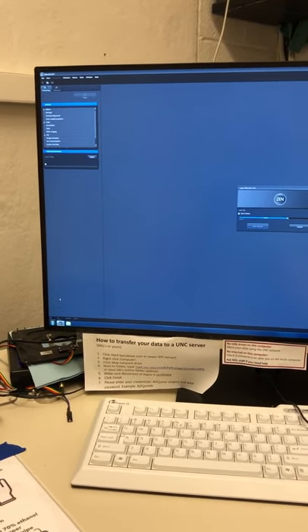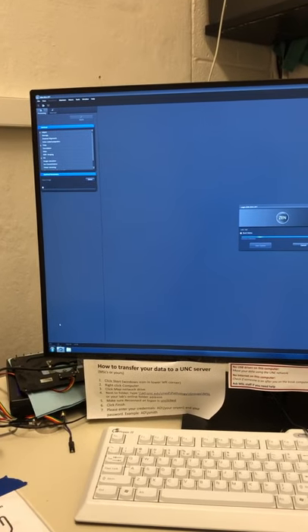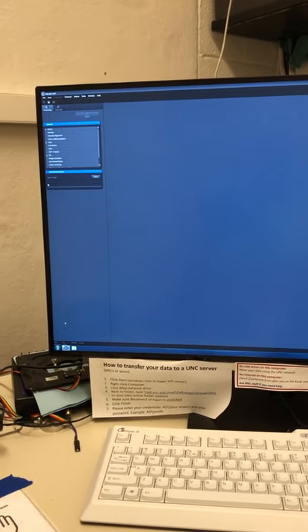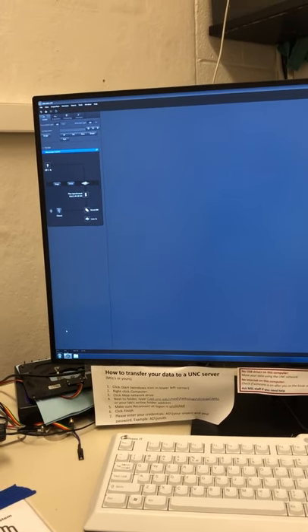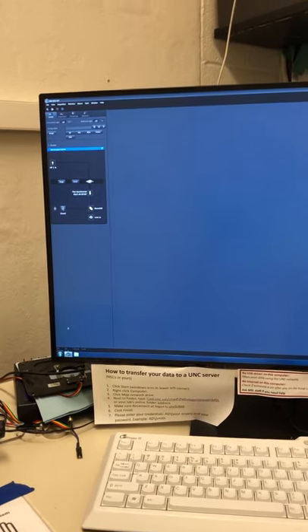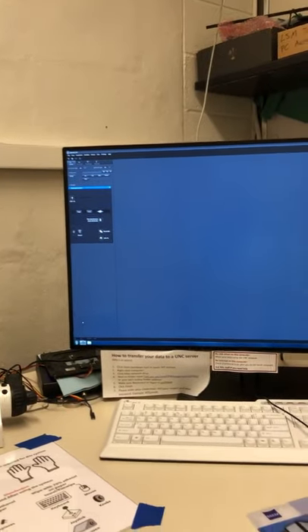If startup errors appear, please let the staff know. That doesn't happen very often, but those messages may tell us whether we can solve it by restarting or whether it's something more serious requiring a call to Zeiss. You can see the system is now ready to go, so let's put on a sample.